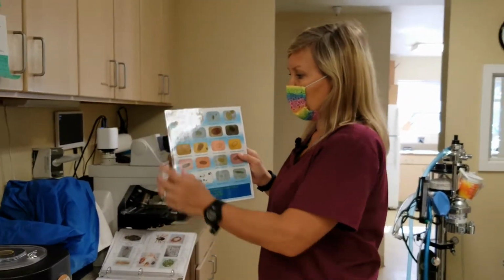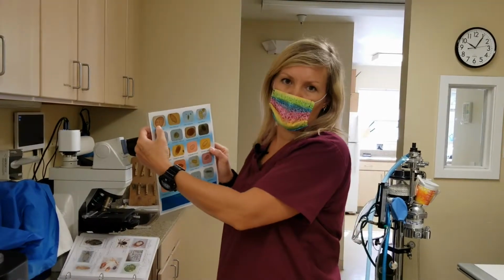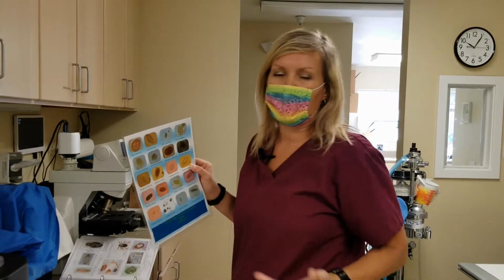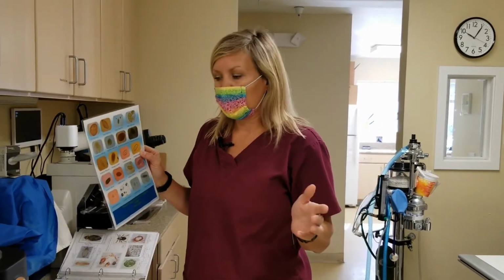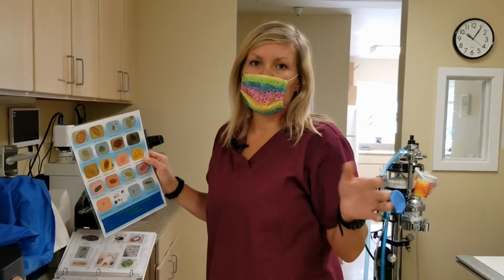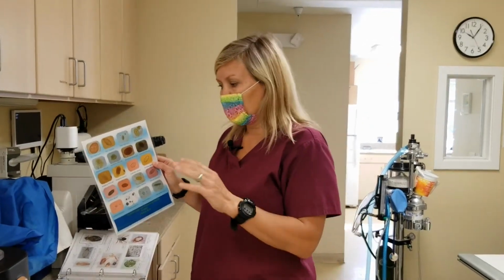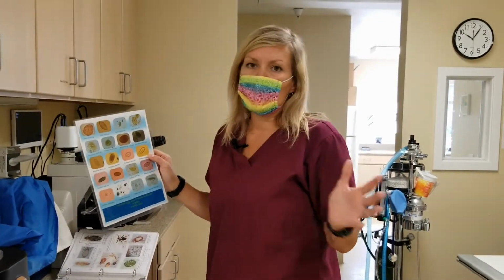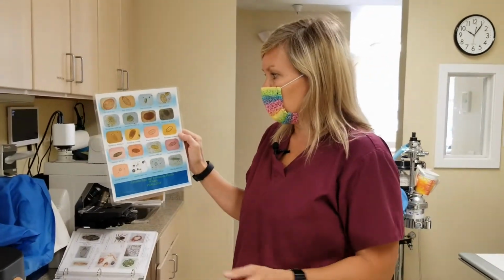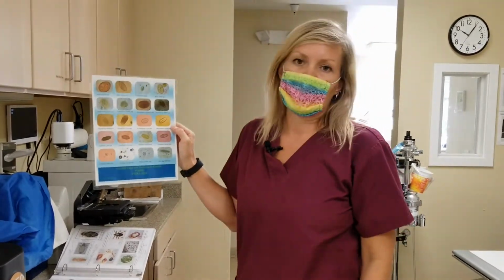For example, this one up here is a fluke egg, and that's common in a raptor. If we see a few of those, we are not necessarily going to treat that animal for that parasite. If it's a very low burden, sometimes we don't even need to worry about it. But if we get a pelican in, for example, or another seabird that has a huge amount of roundworm, which are these dark eggs here, then we have to treat them for that.